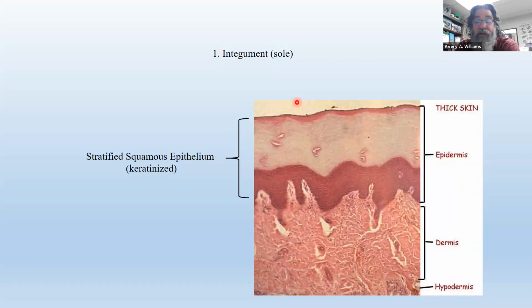Why would you do that? Well, it's supposed to be like that, okay? This thick layer of dead cells helps protect you. And it's this protein keratin, this dry protein that helps envelop your integument, your skin. And so there it protects against foreign invaders, dirt and germs getting in to deeper, more sensitive tissues, because this is like inside your body down here. And of course, it forms like a veneer on the outside of your body, like a cuticle, to prevent your body from losing body water. So it helps retard water loss. And so it's all kinds of great things.